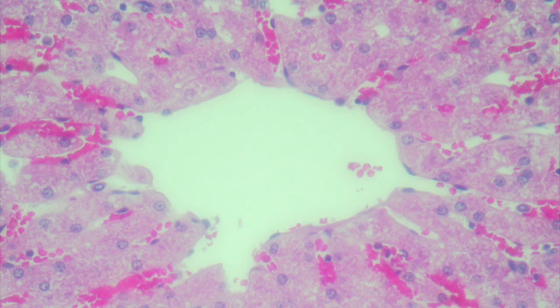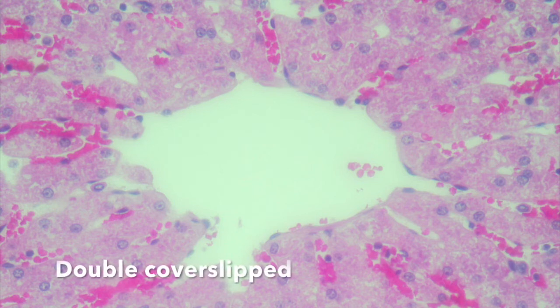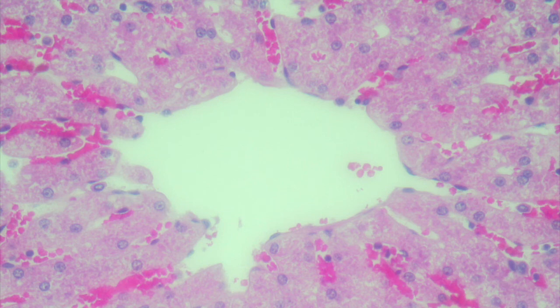However, if we had accidentally applied 2 cover slips, and this is not the same section, but it's a serial section stained at the same time, the same location within the tissue, having that extra cover slip actually makes that look less clear. So the optics of the scope are designed such that you're looking through air, then through to glass, through to mounting media. If you have that extra layer of air sandwiched between the 2 cover slips, then it gives you that kind of cloudy appearance.